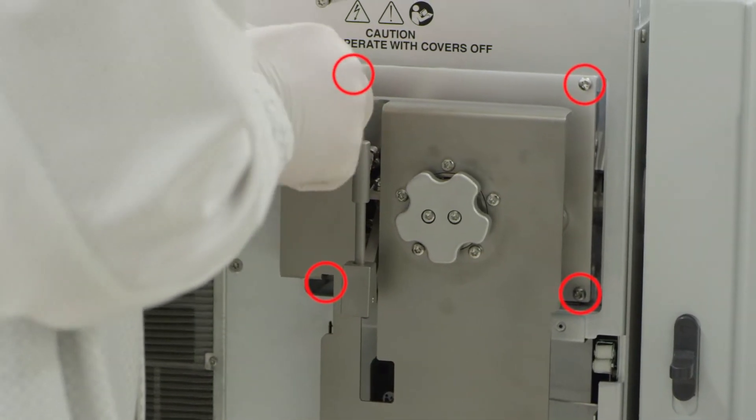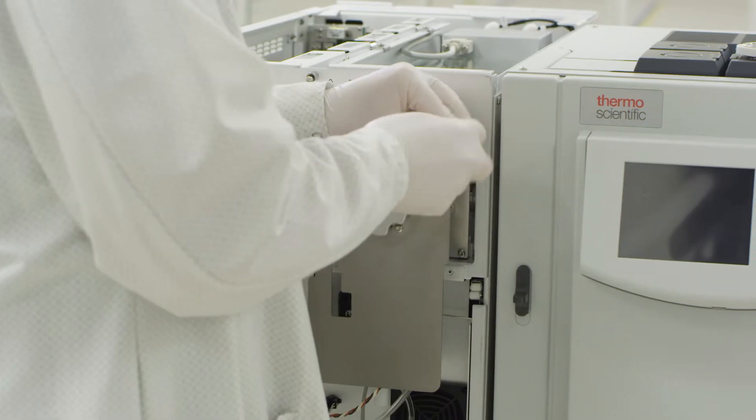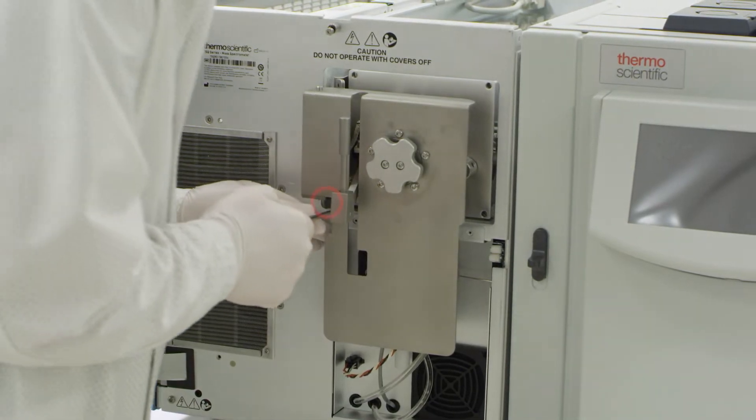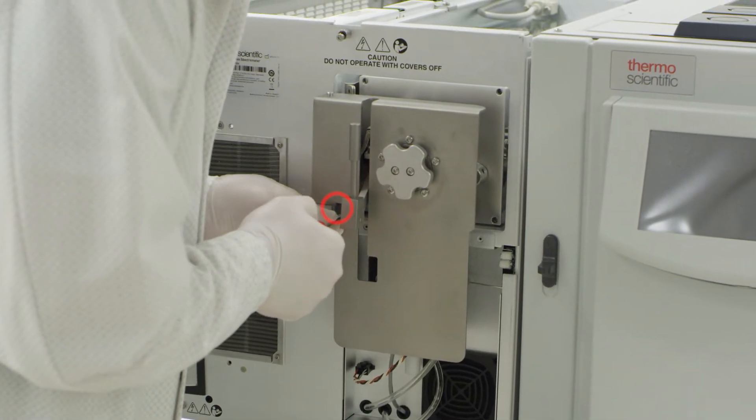Remove the four screws which secure the manifold door to the mass spectrometer. The fourth screw is not entirely visible when viewed from the front.